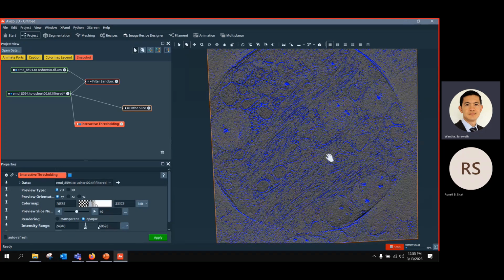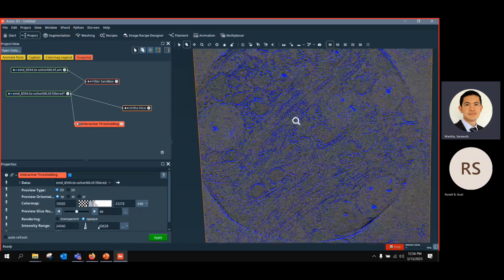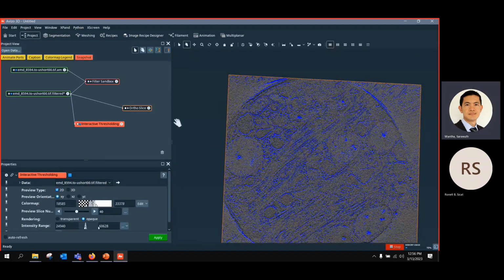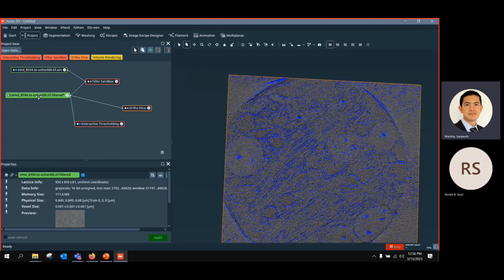That's why we need, later maybe, deep learning and AI-assisted tools to segment these kinds of images. And that's also why it's important to use the segmentation workflow. For example, you can use some kind of drawing or even the super pixel that can segment it into small cells or jigsaw, and then you just select only a few parts. Now I go to the segmentation workflow with these images here.